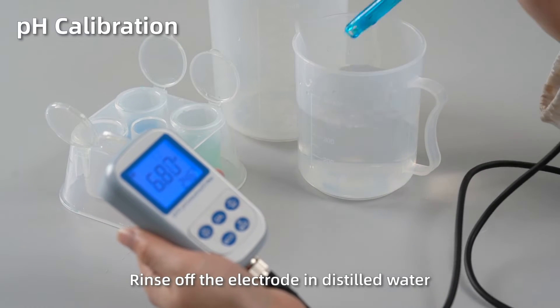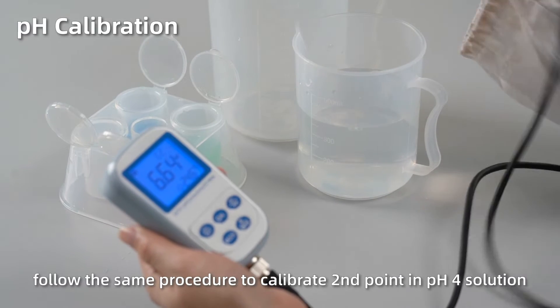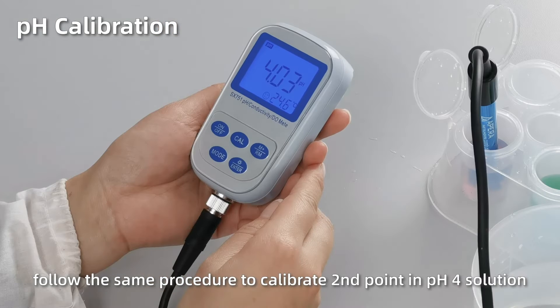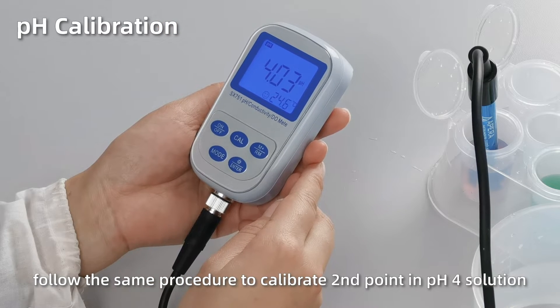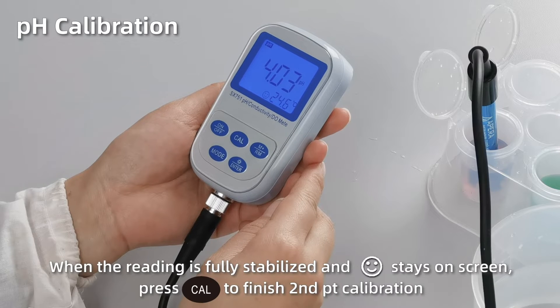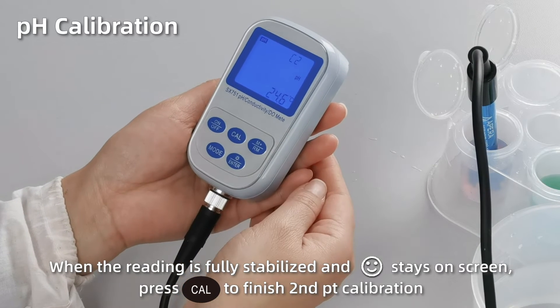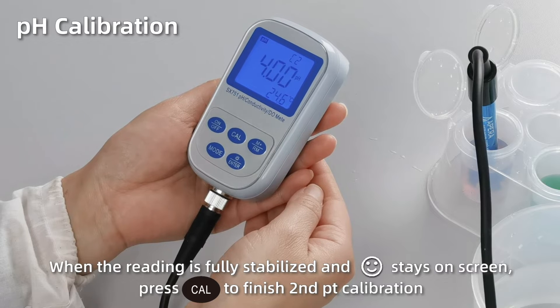Rinse off the electrode in distilled water. Follow the same procedure to calibrate second point in pH 4 solution. When the reading is fully stabilized and the smiley face stays on screen, press cal to finish second point calibration.